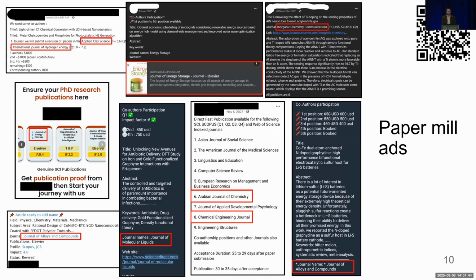I can tell you that there's a lot of metadata embedded in biological microscopy images, but not actually shown in the image itself. Transmission electron microscopy has very limited metadata, which is interesting because it's very closely related.